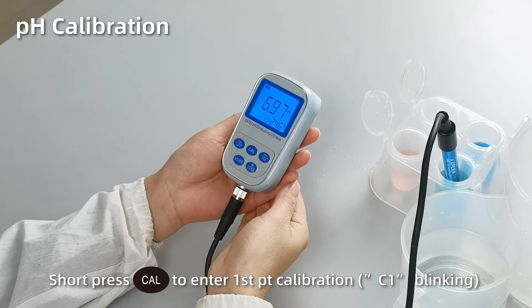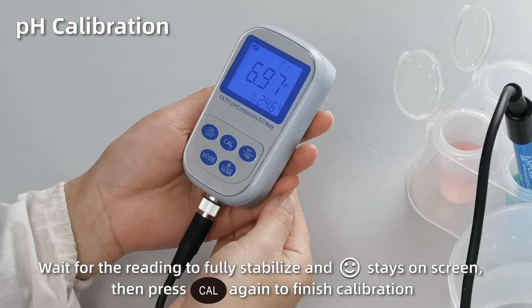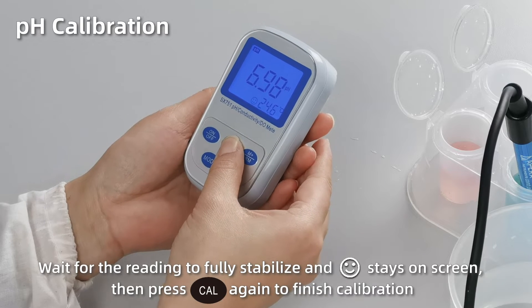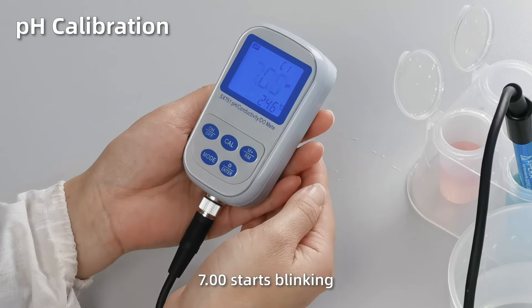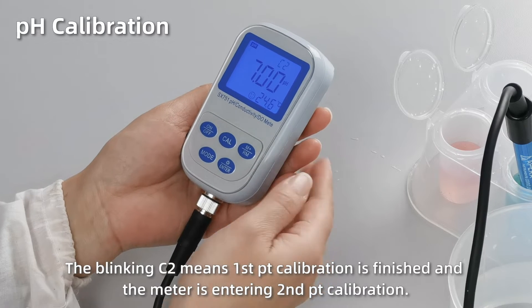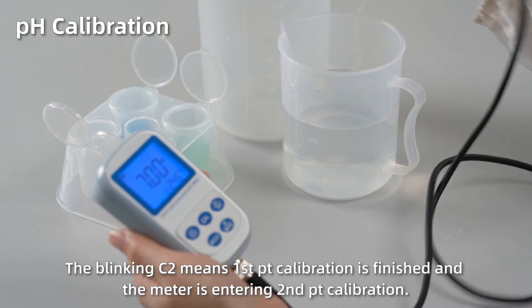C1 blinking. When the reading gets fully stabilized and the smiley face stays on screen, press cal button again to finish the first point calibration. 7.00 starts blinking. The blinking C2 means first point calibration is finished and the meter is entering second point calibration.